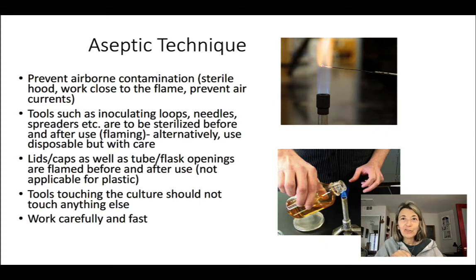anything that you touch your culture with, it can be a loop, especially you don't want to touch anything else during the process. And if you do, you have to repeat the sterilization and work carefully and fast. So these are a little bit like playing an instrument. You get used to it the more you do it.